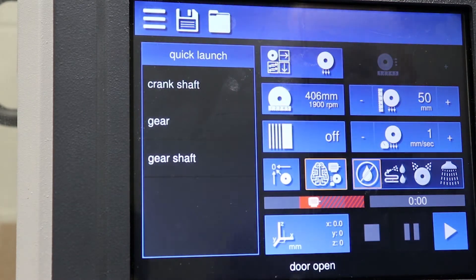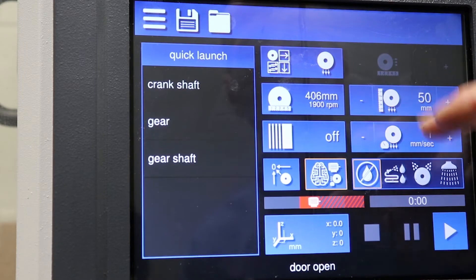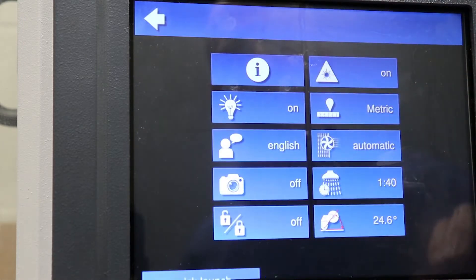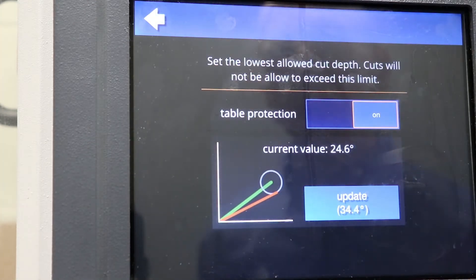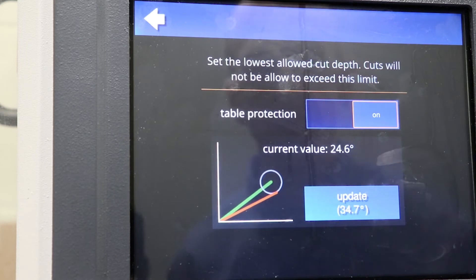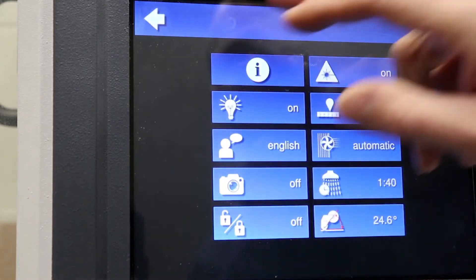Back at the home screen, you'll see some other features — options to set your feed depth, your feed rate, and your cut depth very easily. There's also a feature called Table Protect on this saw. This allows the user to set a specified distance the saw is able to advance before the machine will stop the advance of the blade. This prevents damage to the table — the blade won't cut through parts that you don't want to cut through — and it's very easy for the user to set this for any given cut or shift to prevent damage to the machine.